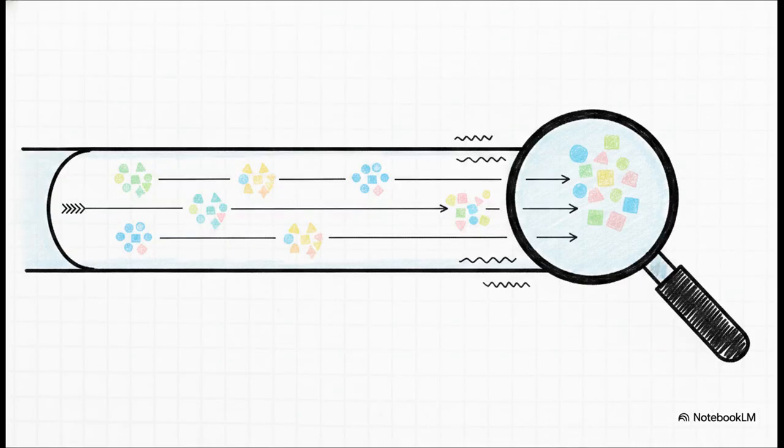And here's why that specific bit of physics actually matters so much. Maintaining a low flow rate of the mobile phase is kind of the ultimate secret to the system's performance. When the flow rate is low, it perfectly maintains that laminar flow dictated by Poiseuille's law. This carefully controlled movement minimizes the dispersion, or the spreading out, of the compounds as they travel through the instrument. And why is that absolutely crucial? Well, because minimizing that dispersion directly improves the detection limits. It allows the machine to reliably identify even the absolute most microscopic, faintest traces of a chemical.